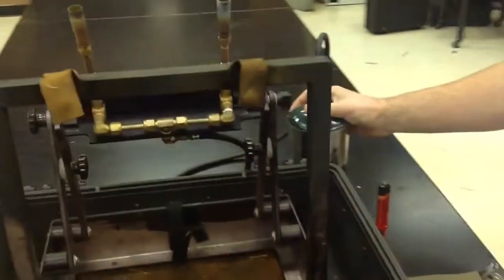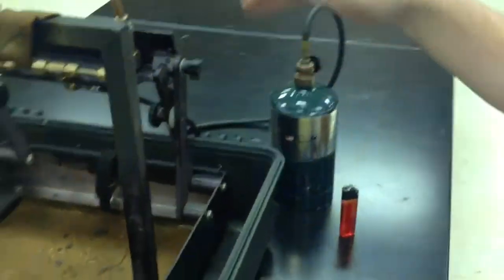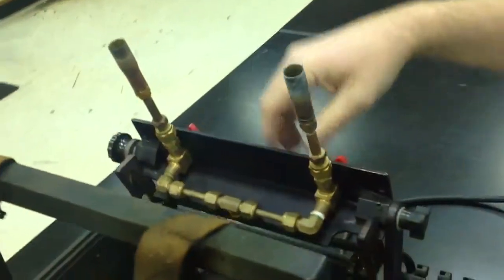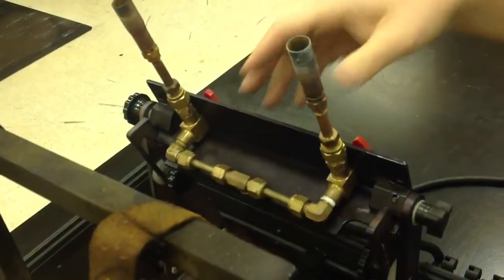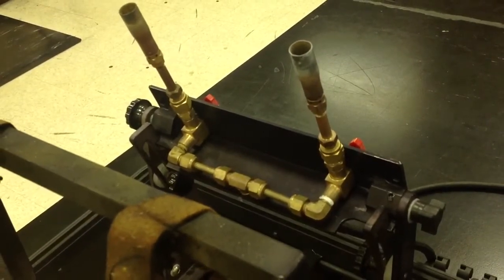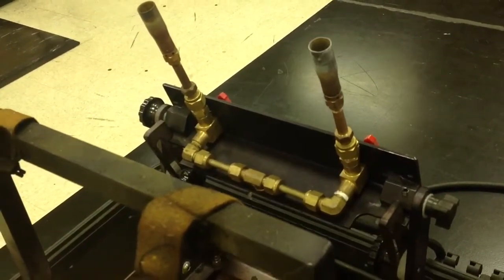We'll use a standard propane fuel source that's tied through a common line to two burners. The common line and split helps us to ensure that we're going to have equal pressure and flow presenting the fuel to both sample specimens.